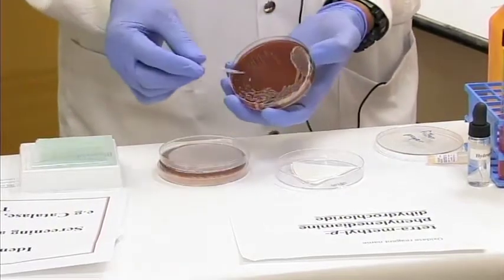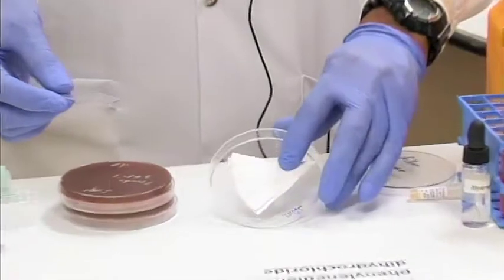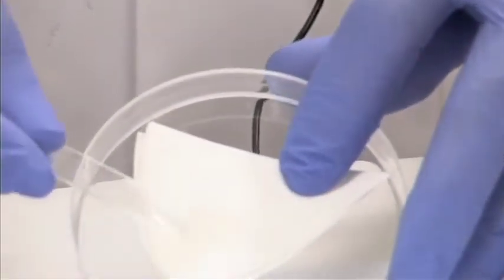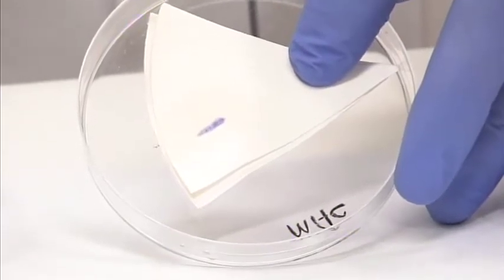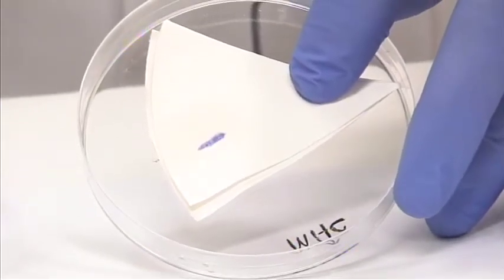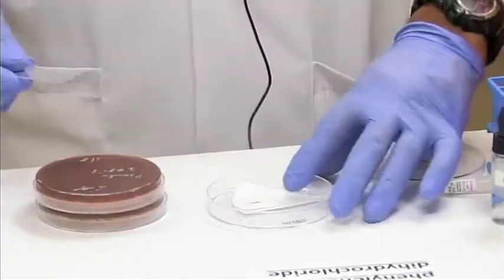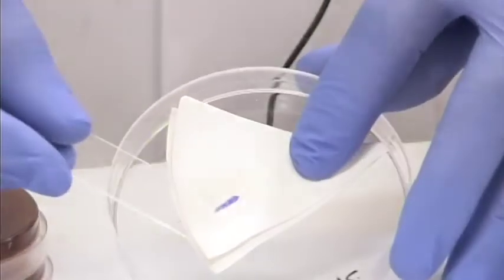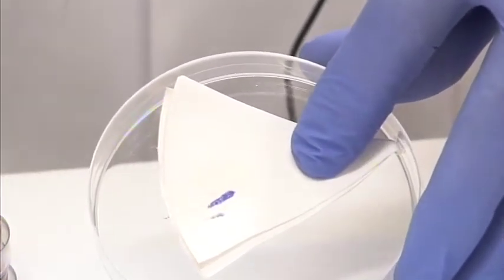So we're going to pick up some bacteria here. This is Pseudomonas aeruginosa. And then we're going to smear it onto our filter paper. And if you notice, the reaction changed very rapidly after a few seconds. It went from colorless to a purplish blue color. I'll repeat that again to show you. So pick up some bacteria of Pseudomonas, smear it on, and we see the reaction developing right before your eyes, that bluish color. So this is a positive reaction for your oxidase test.